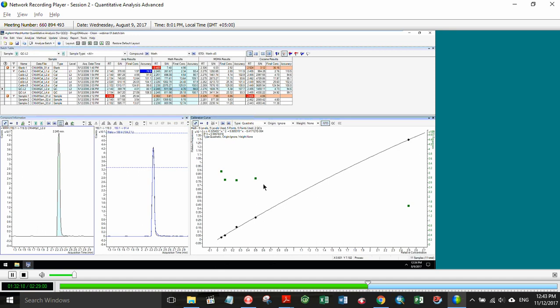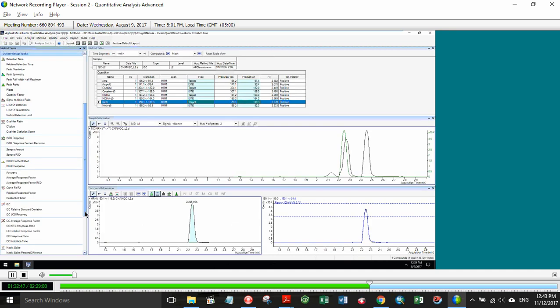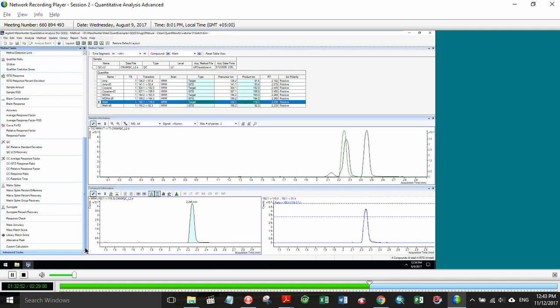Okay, one last question here. Can we flag results that are higher than MDL in the batch table? Yes. Okay. Howard, if we go into method editor and outlier tasks, we will see that we can, well, maybe I didn't listen. You said higher than the MDL. But it said higher? Right. Higher than MDL. The answer to that would be no, because the MDL, which just went past, is at the top of your list there right now.